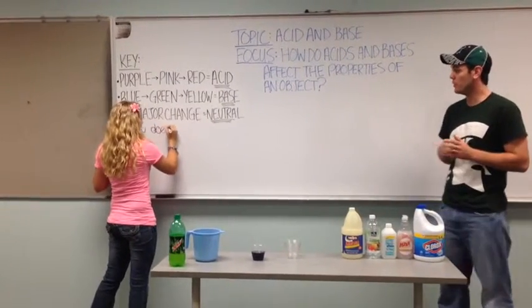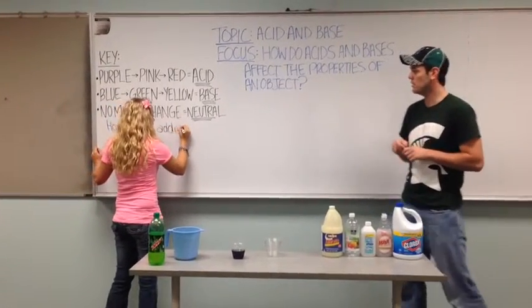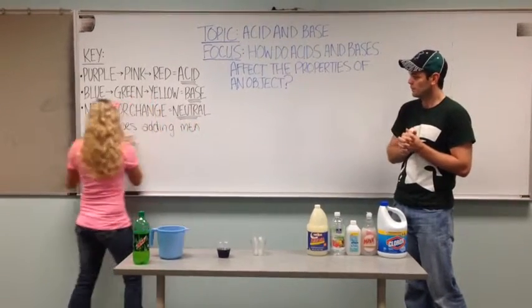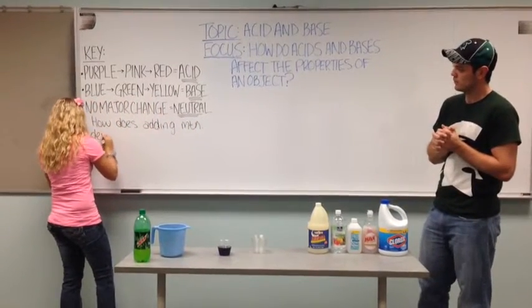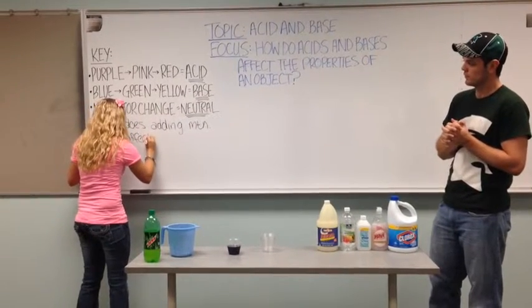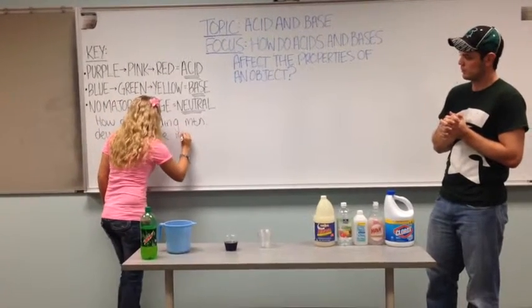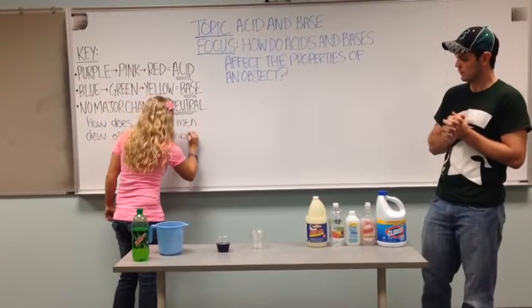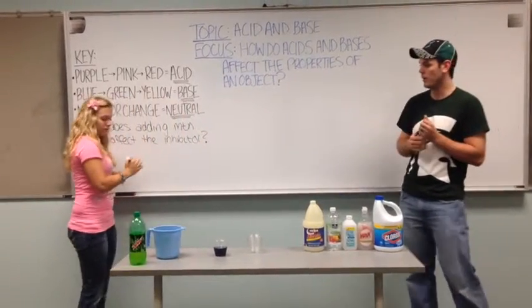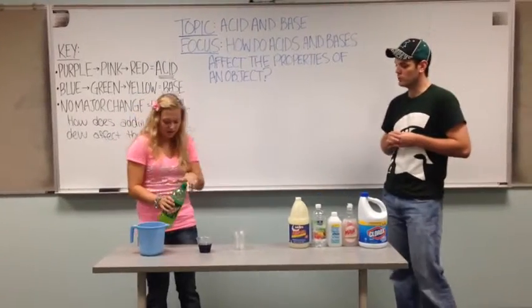That is a very good question. When you're done writing that, you're going to test it in our indicator and see if it changes the color or what color it changes into. Okay, now go ahead and try out your question. Now, do I pour a little bit or a lot? You can pour as much as you want.